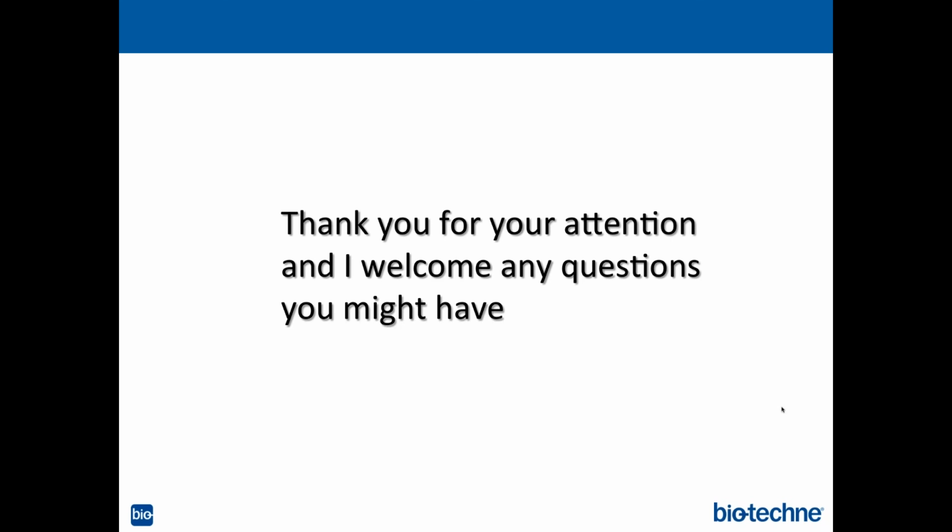And then when we make all 3 or 4 versions, we're monitoring those, and then we're choosing the one that, if we were to see precipitation, we're not going to go with that. But again, we haven't done large numbers yet that I can tell you for sure. But I haven't seen it so far. Okay. Thank you. You're welcome.